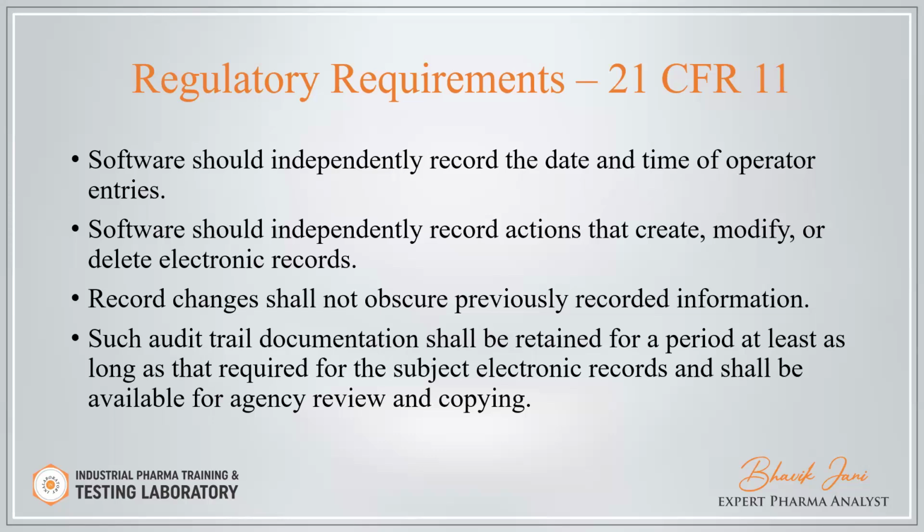Each audit trail documentation shall be retained for a period at least as long as required for the subject electronic record and shall be available for agency review. Each and every record shall be available as long as required, as per our policy and organization requirement, and it should be easily available for agency review.